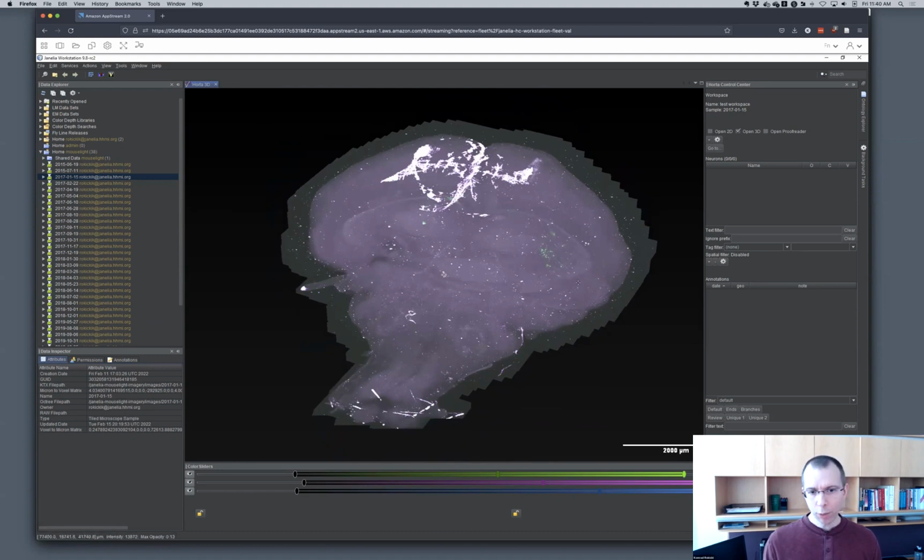So that's a really powerful way of working with really large data sets, because you don't necessarily want to move all this data across the internet. And here you're just getting a very lightweight stream out of the cloud, and all the heavy lifting is done on AWS.